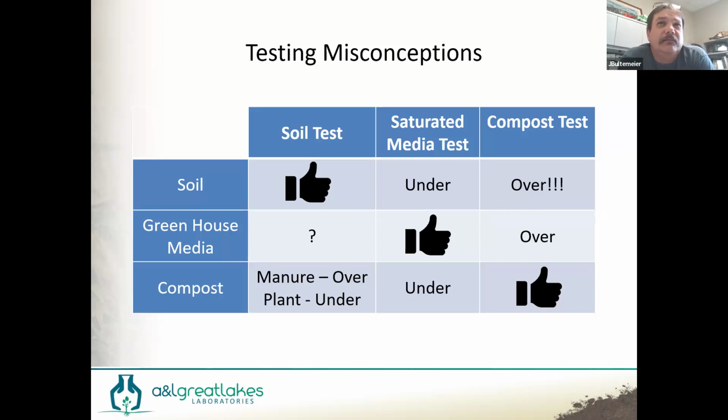But it depends what that neutral media is made of. If that's vermiculite, cocoa fiber, whatever that material may be, if it has some elemental content that I can dissolve with an acid, I may bias the sample upward. I don't know, probably not likely, but don't push our luck.